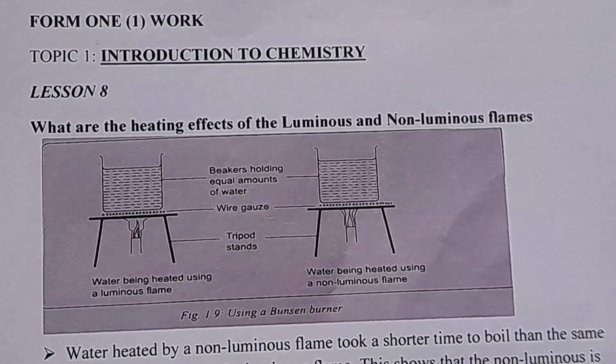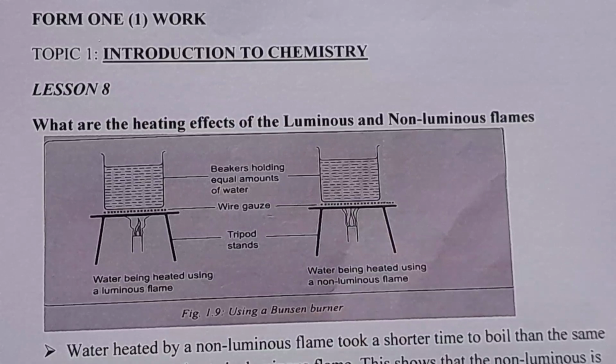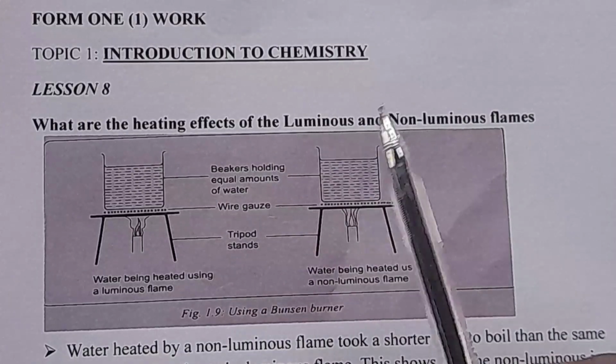Hello students, welcome. Previously, in lesson 7, we were dealing with the difference between luminous and non-luminous flame. So in lesson 8, we're starting with the heating effects of luminous and non-luminous flame.